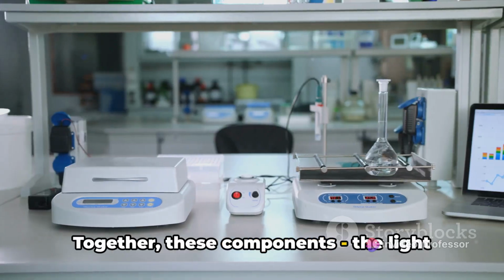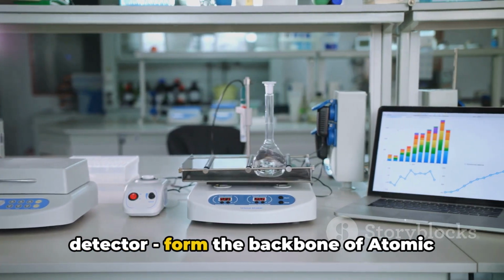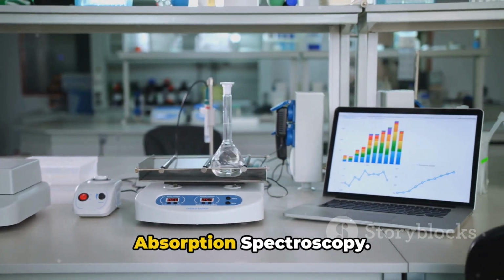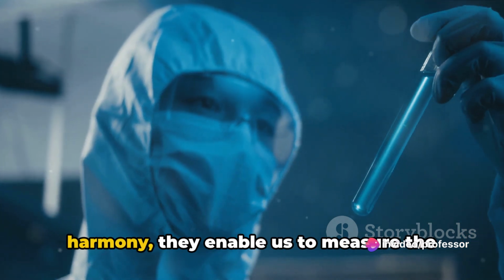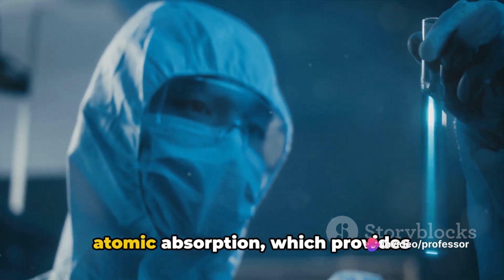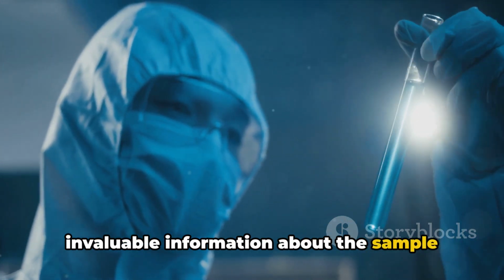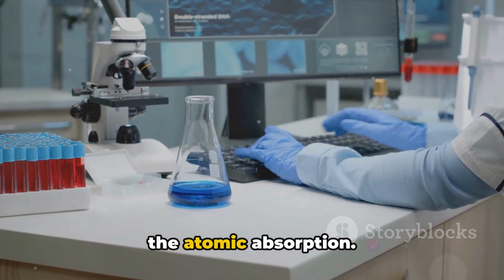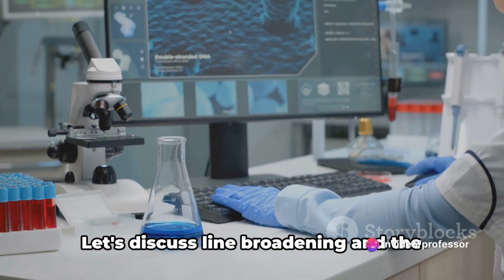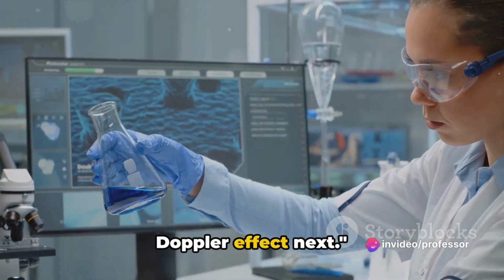Together, these components, the light source, atomizer, monochromator, and detector, form the backbone of atomic absorption spectroscopy. Each plays a crucial role, and in harmony, they enable us to measure the atomic absorption, which provides invaluable information about the sample being analyzed. With these instruments, we can measure the atomic absorption, but there's more to it. Let's discuss line broadening, and the Doppler effect next.